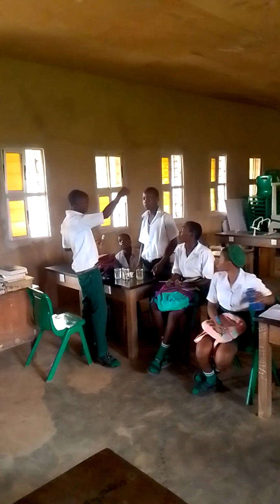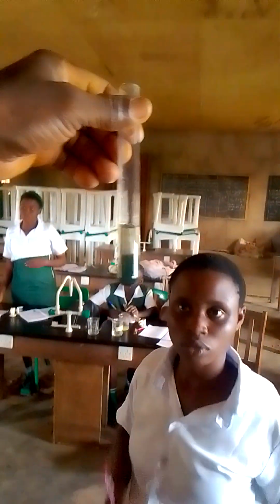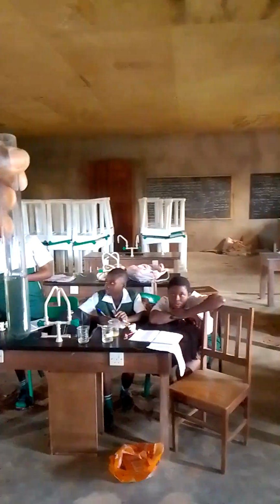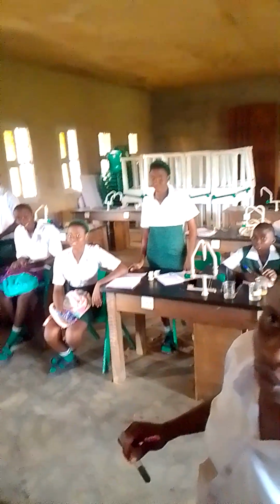Let's see what happened to it, whether there is any change. When it forms, it turns to brown. I think so. Yes, it turns to brown. Let me see yours. Yours did not form well. Bring it. Yes, you see it. It turns to brown. That one is the correct one. Bring it, let me see. As it stands, it turns to brown.